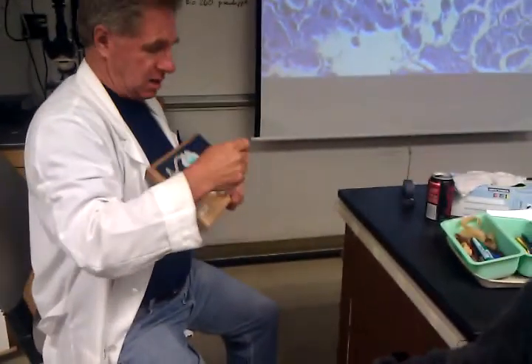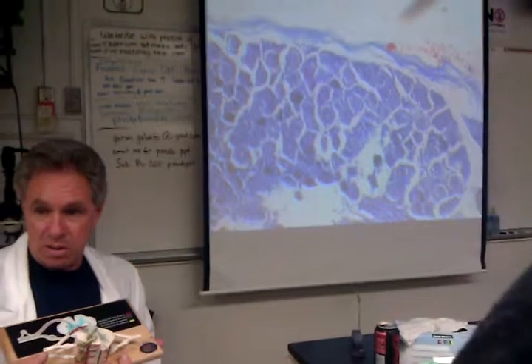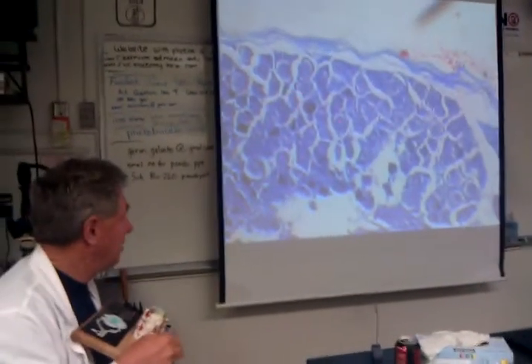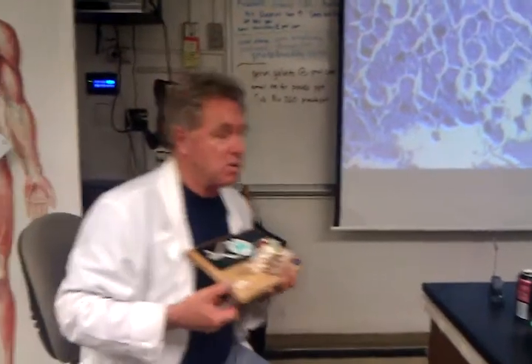So what you're looking at is a blow-up of the dorsal root ganglia. So those black dots, those are the sensory? Those are the cell bodies of sensory neurons. Are those the neurons? Those are neurons, sensory neurons. All those round things are neurons.